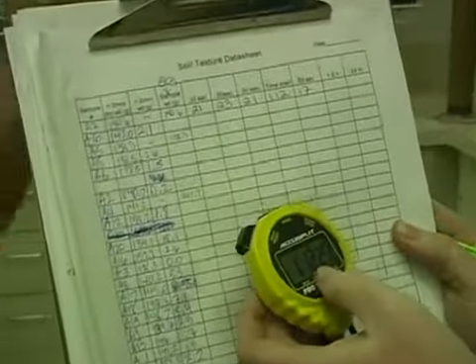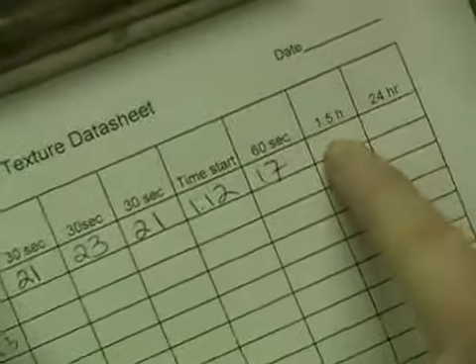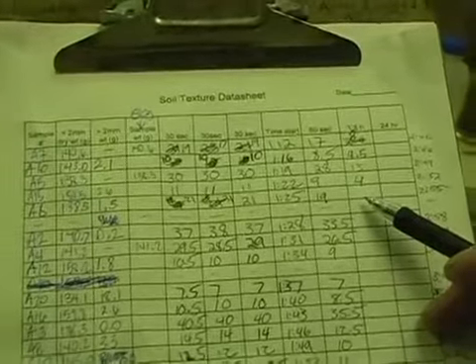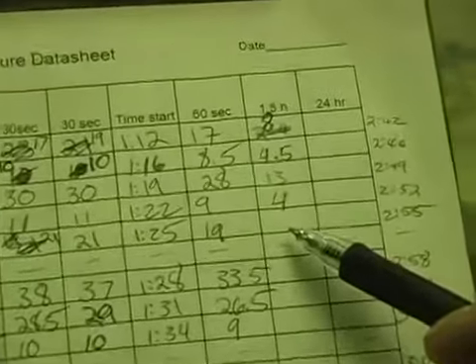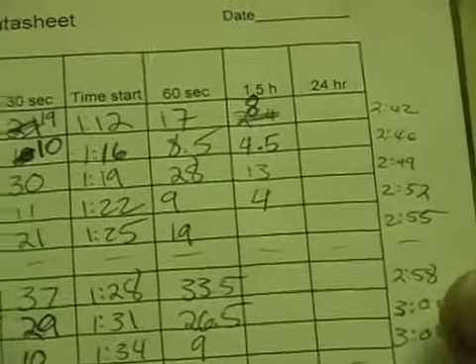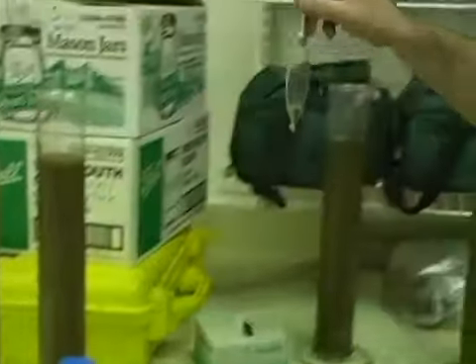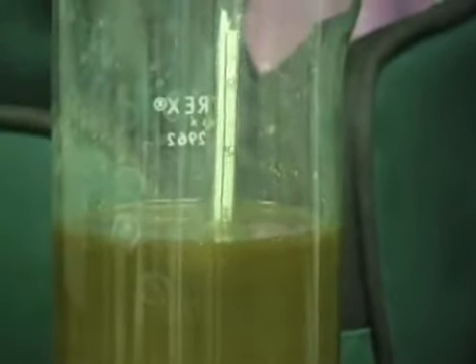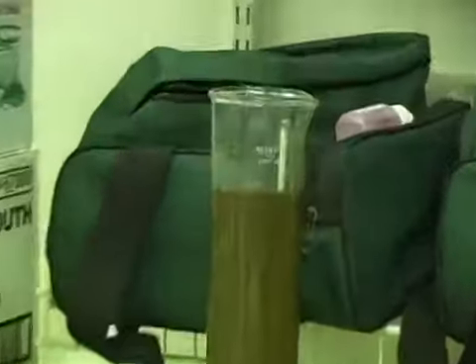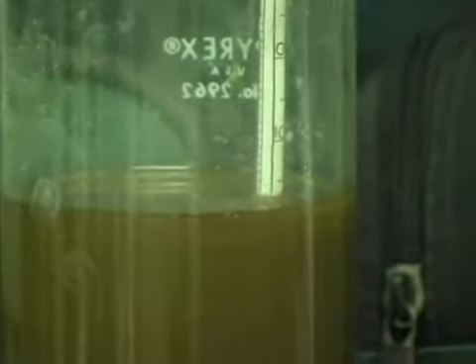At this point, we record the time that the test was taken because we'll need to return and take an hour-and-a-half sample of the undisturbed column. So it's been almost an hour and a half since we started mixing these soils, and so exactly at 2:55 is when we're taking the next reading, for example, and we'll just take another hydrometer reading without stirring it. So these are the hour-and-a-half readings that we're taking, and then we'll come back here tomorrow and we'll do a 24-hour reading, and then after that that part of it's over.